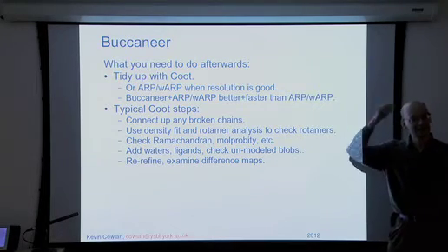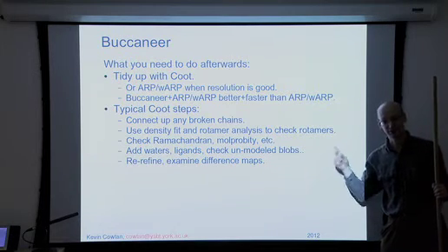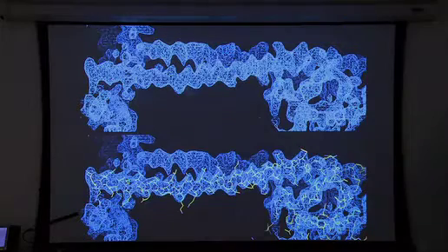Occasionally, you also get extra residues built on the end which aren't in the sequence. Then you need to check your sequence, but usually it means it's just been too enthusiastic. Re-refine and examine the difference maps.